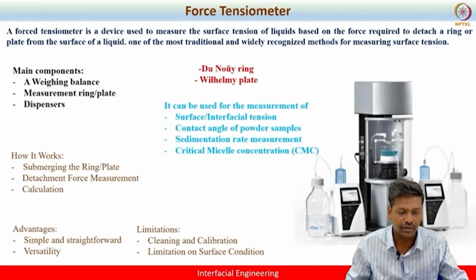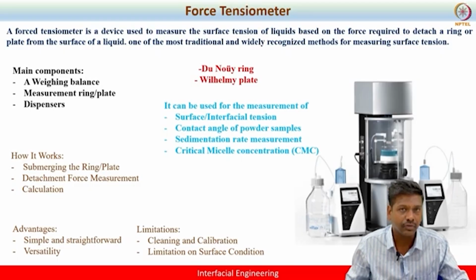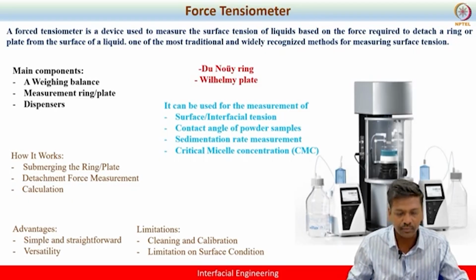So force tensiometer is one of the devices used to measure the interfacial tension of liquids, right? If you want to measure, let's say, the interfacial tension of various fluids, you will need a device like force tensiometer.